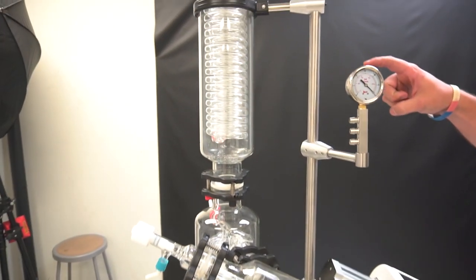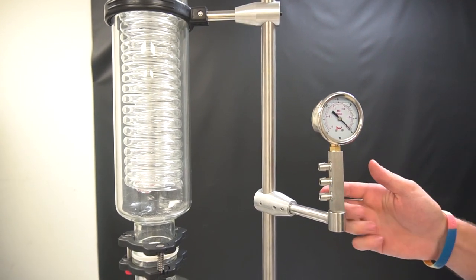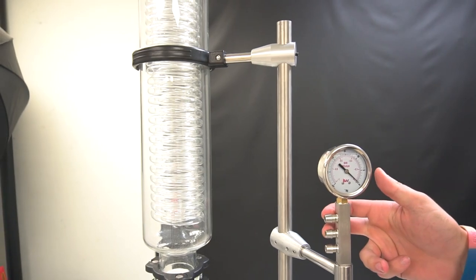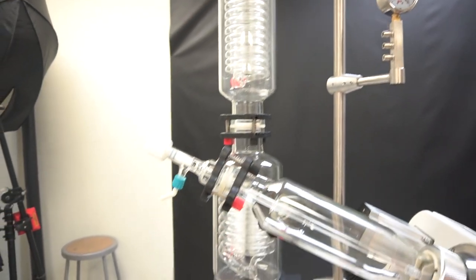Up here, we have our vacuum manifold, gauge, and three barbs. You hook one to your vacuum pump. The other two barbs — one goes to the vacuum port up top, and then one goes to the vacuum port on the receiving flask.